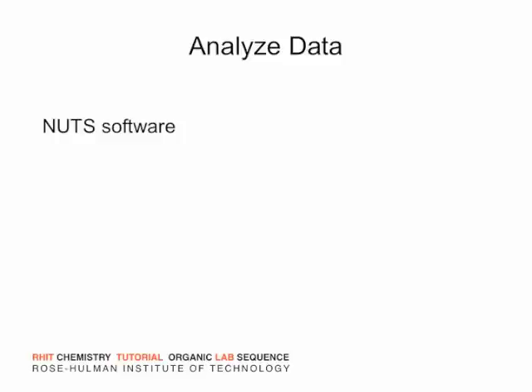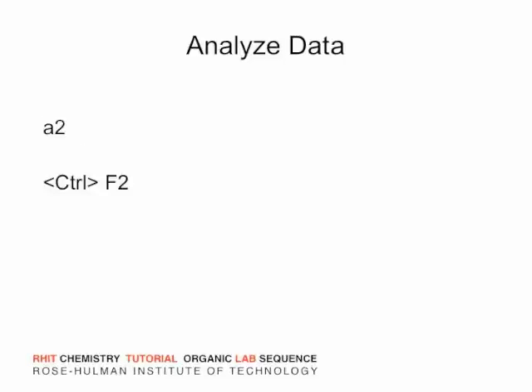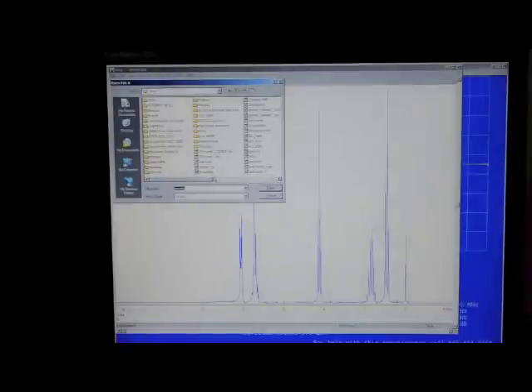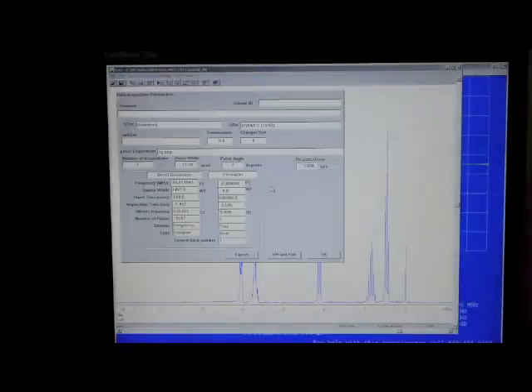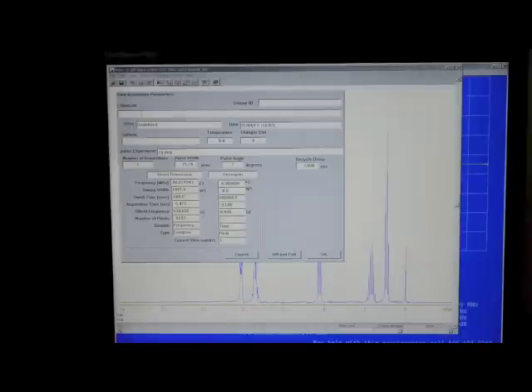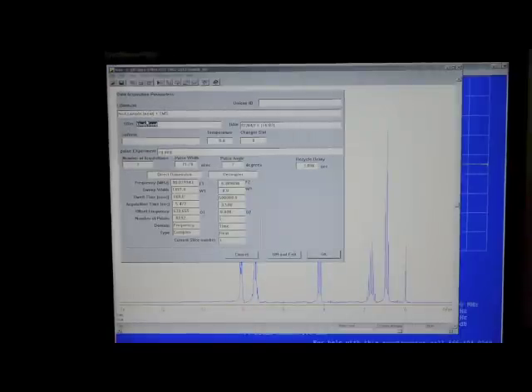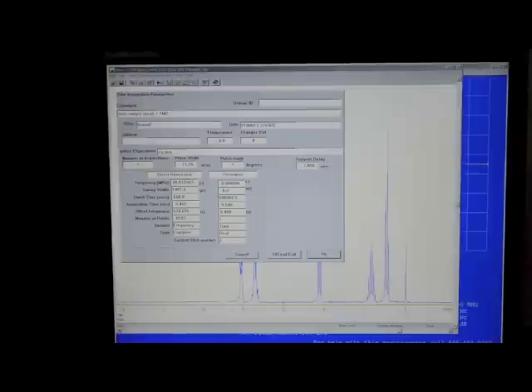The NUTS software is used for data analysis. I will go over a few simple aspects of using this software package. Hold down the CTRL key and press the F2 key. The program will then ask for the file to use. Open the file that you saved. Enter the sample name and solvent information in the dialog, and put your name in the user field, and then click OK.